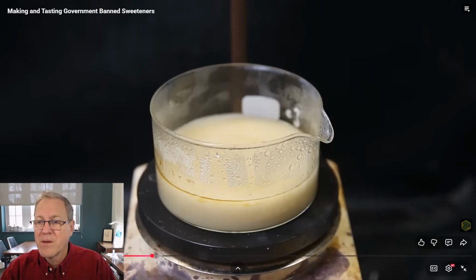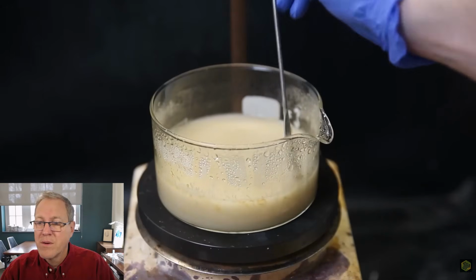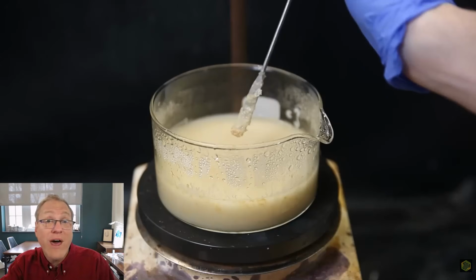But there was still some colored liquid sitting on top. But when I scraped it with a spatula, it all started to solidify. So in these mixtures, even though it's oily, as soon as you agitate it, that disruption is enough to provide a site of nucleation, solids form, and once you get the solid form, all that oil fairly quickly solidifies. So, in no time, boom, he goes from oil to solid.